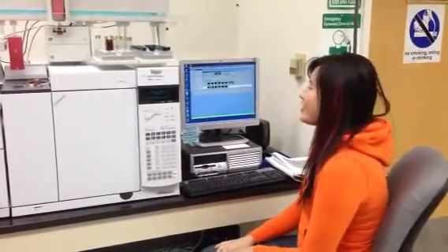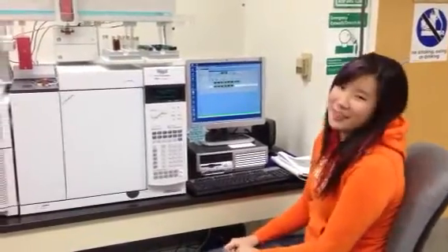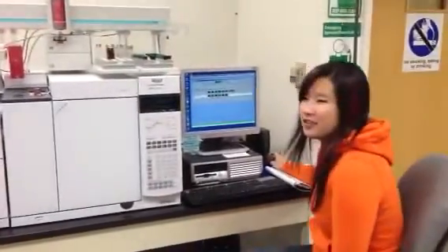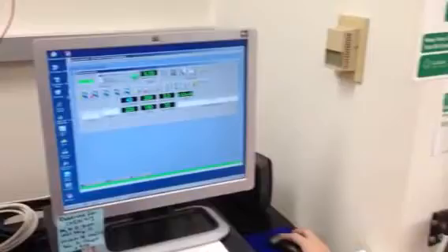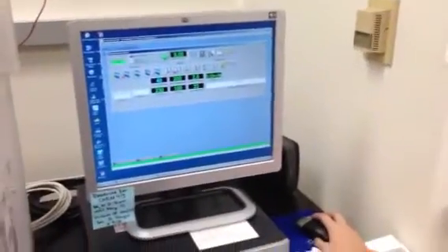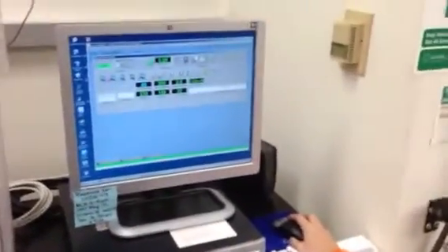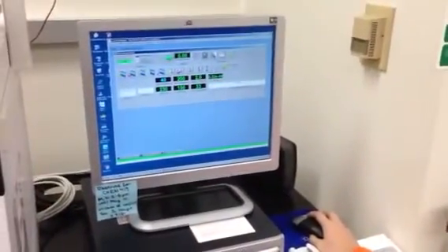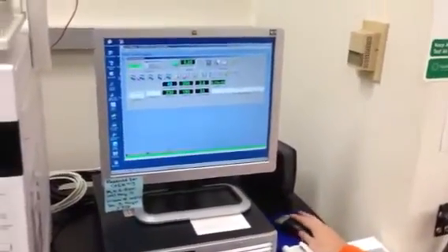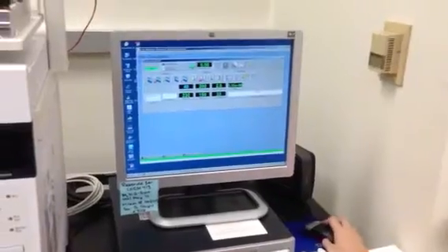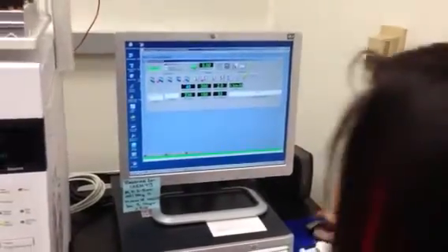Hey everyone. This is the GCMS and this is what the screen should look like. It shouldn't be turned off when you first enter the room, but this is what the screen should look like when you first try and use the instrument. It should say idle and everything should have numbers and stuff.